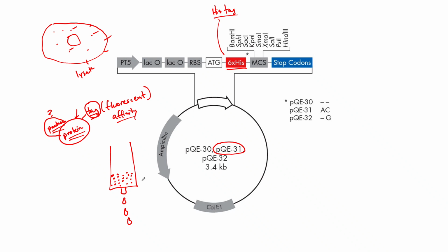Then, after you've washed all of these other unbound proteins away, you can elute your protein with the tag on it, and its binding partner will come along with it. And then you can look and see what is bound to it. We're using biochemistry. Using a Western blot. I keep saying biochemistry, but really it's a Western blot, which you've learned about before in class.